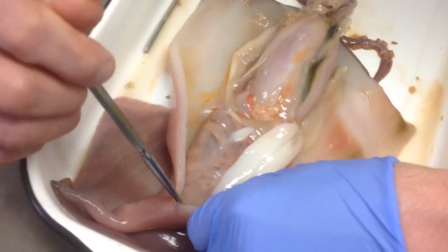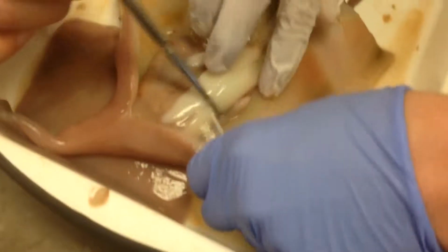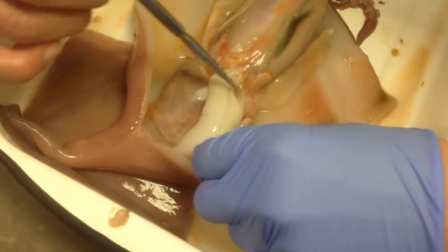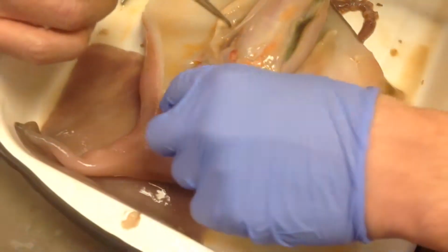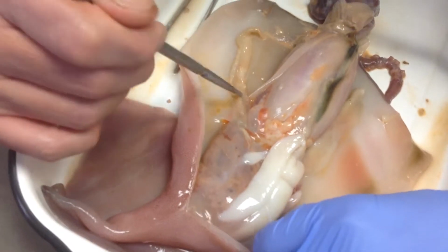It's not that low. There's some tissue here, and there also seems to be something directly below. There's a location of parts. Oh, there's another thing down here. I think that's this one. Well, let's get some of that mesentery up and see what it is. What the heck is this? This is featherlight. What is that?